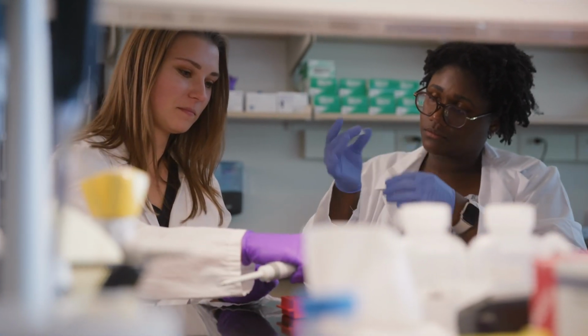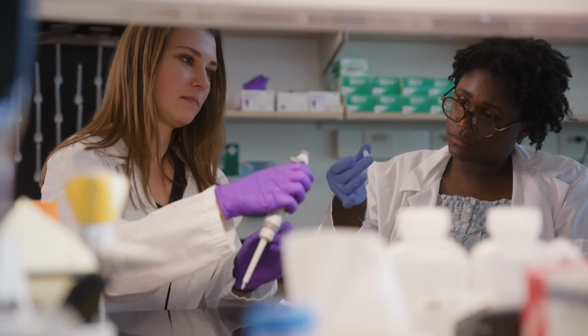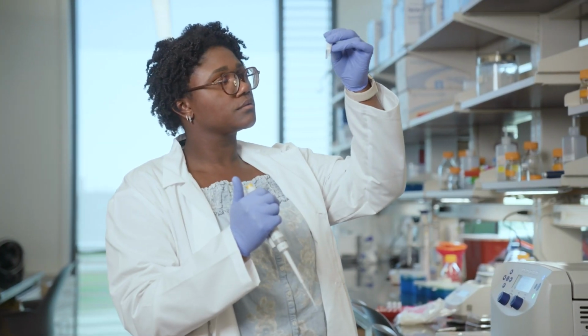starting material. One of the most exciting parts of this is that all of the data collection that happened for the paper was within 2 weeks. So we were able to optimize both our DIA methods, run our libraries, optimize our PRM methods, and run those PRMs to the point where we're able to run multiple calibration curves. And if we would have really wanted to, we could have built multiple targeted assays, but we were really just interested in a specific aspect of T-cell biology. But we were definitely able to do the entire workflow within 2 weeks, including the optimization.